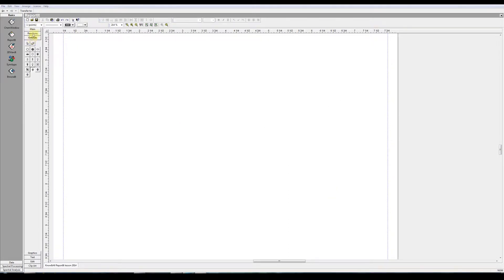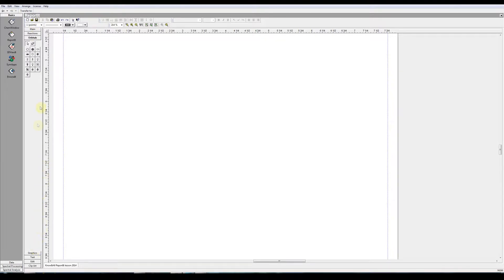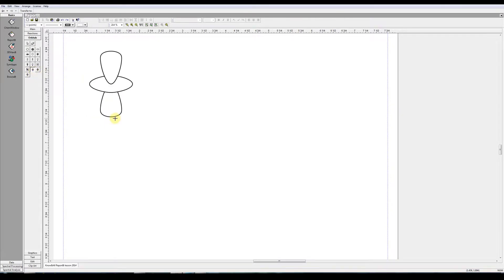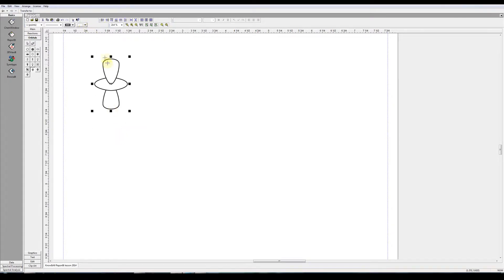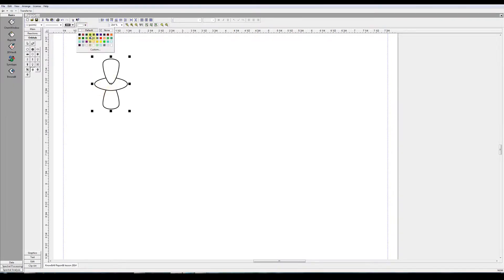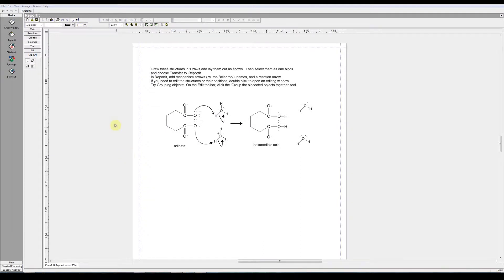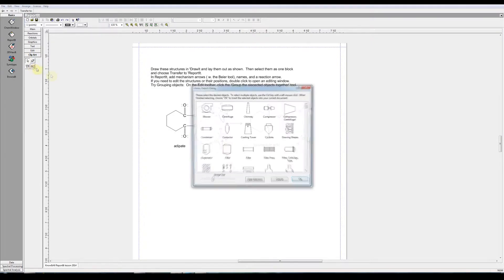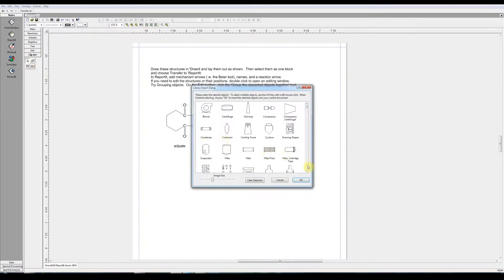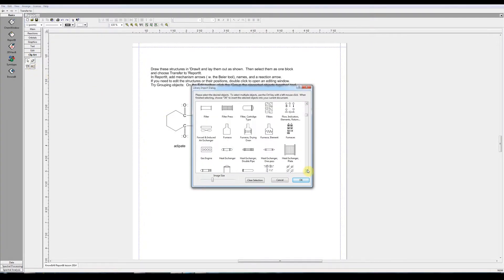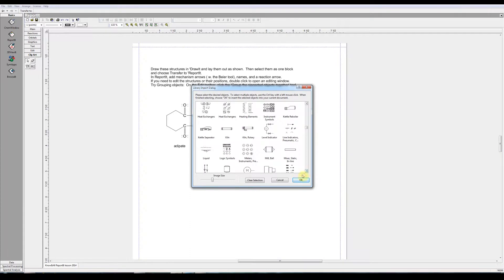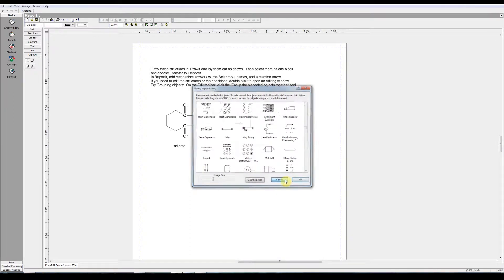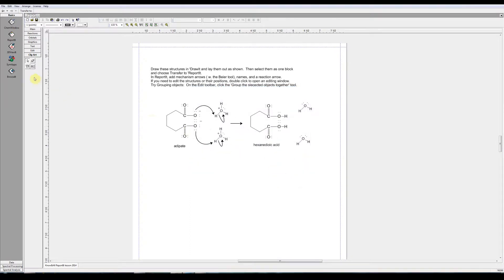Reported also has an orbital tools group here. For example, this would be, I'm just dragging on the canvas. If I hold the shift key down I should be able to adjust the size. This is a dz squared orbital. It is selected and the default color is white. But I could change that to some other color. Reported has a clip art group. These are chemical engineering symbols. But I'm going to cancel that.